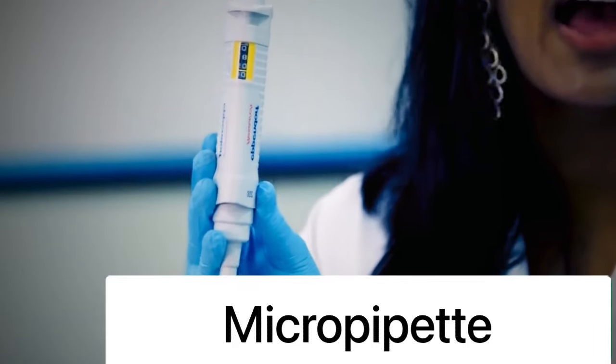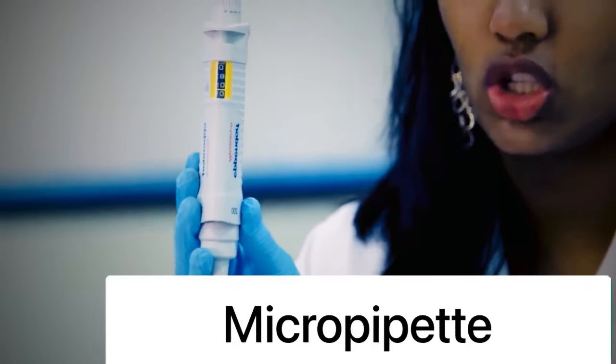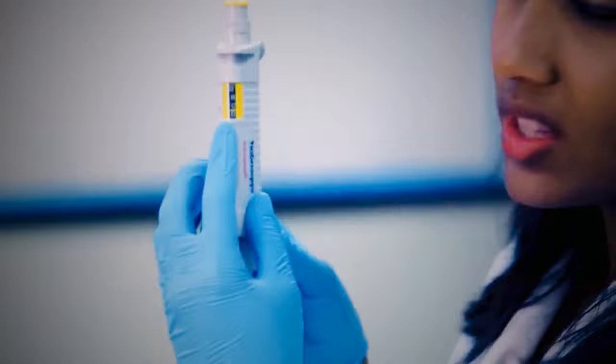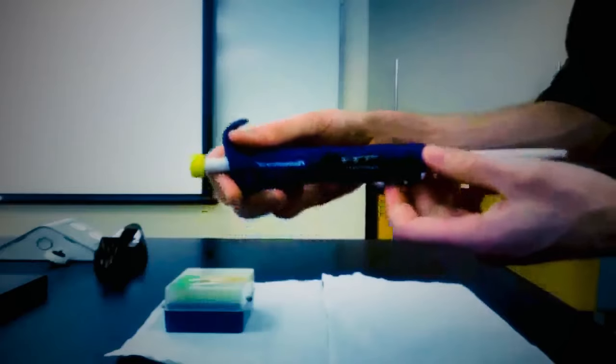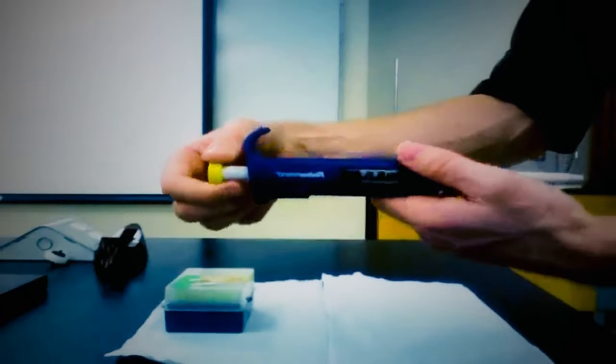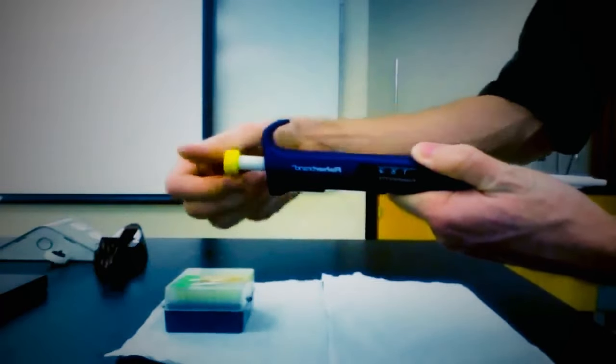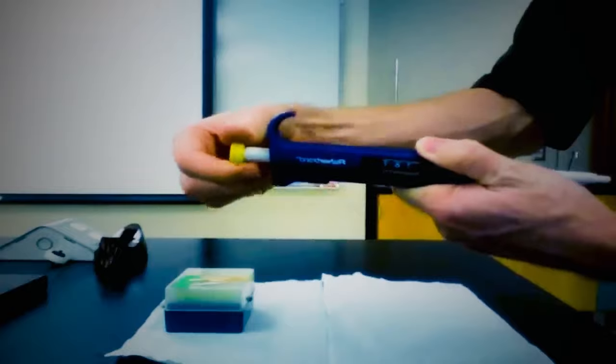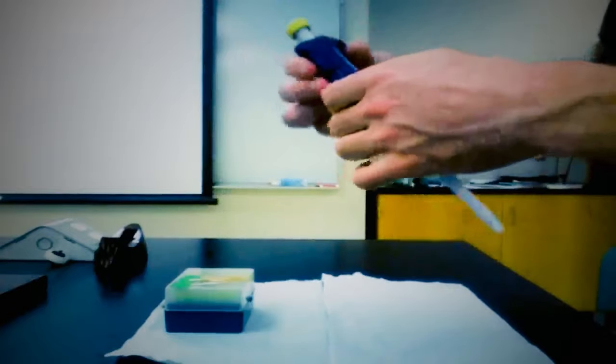Micropipet. Pipets and micropipets are invaluable pieces of laboratory equipment used to draw up, measure, and deliver accurate volumes of liquid. The difference between the two is that micropipets measure between 1 and 1000 microliters, while pipets generally start at 1 milliliter.